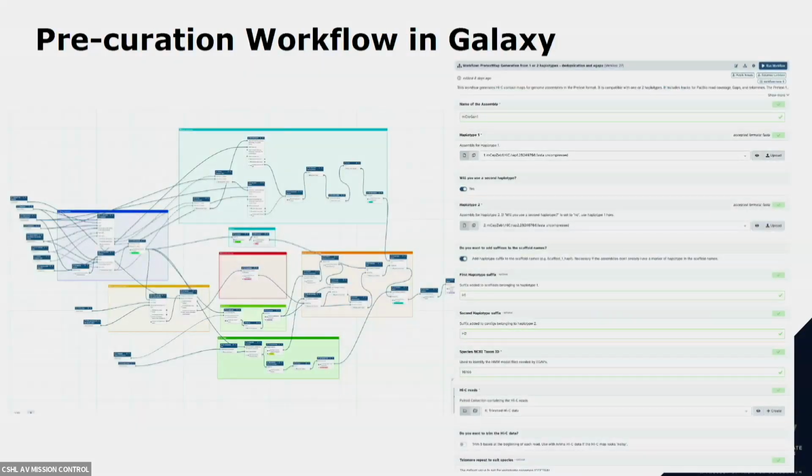So this is what the workflow looks like. I'm not gonna get into detail, but basically we annotate every haplotype separately, we merge the GFF, we align the Hi-C map. Here we have coverage, telomere, and gaps, and all the inputs are whatever is produced by the workflow we published last year that are part of the assembly.